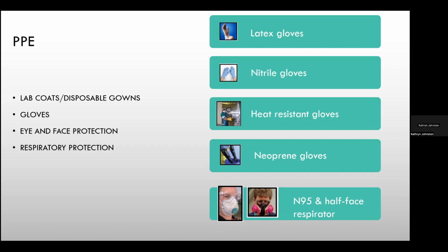Another alternative to the use of goggles and safety glasses is the use of face shields, and they're secondary protectors. And what they do is they protect the entire face. So when paired with a respirator or mask, then they can provide an adequate level of protection.